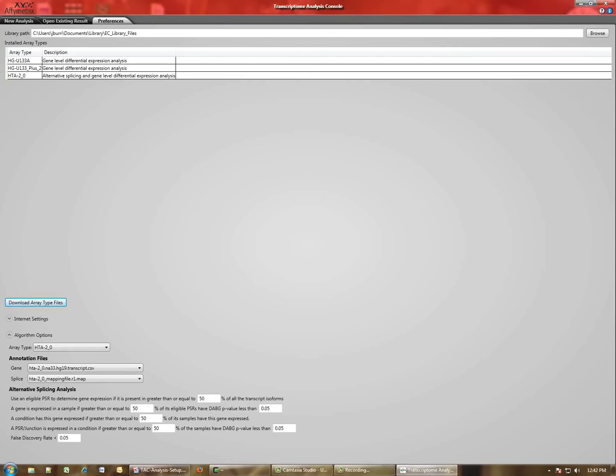It is generally recommended that you leave them at the defaults, but if you are so inclined, here's where you can alter the definitions for eligible probe sets, definitions for when a gene is expressed, condition expression, and things like that.